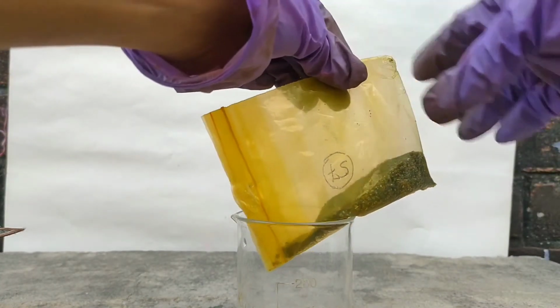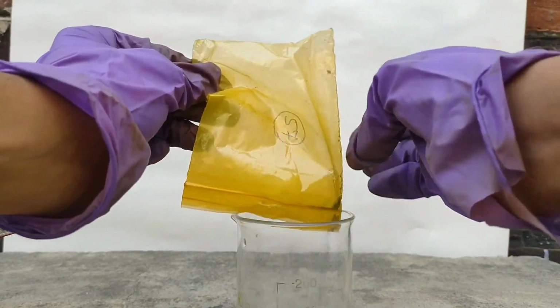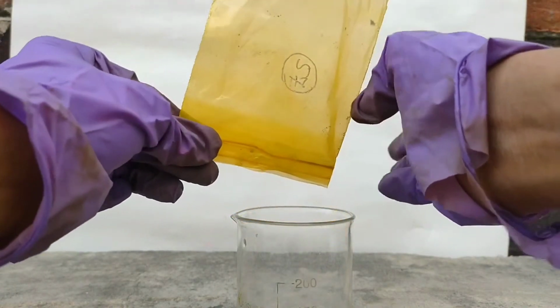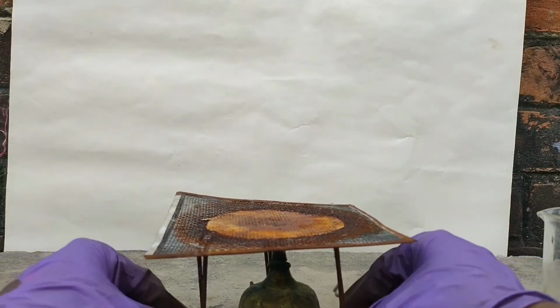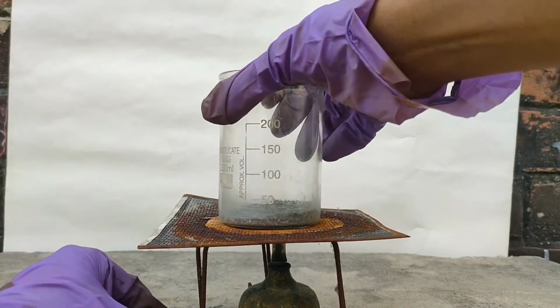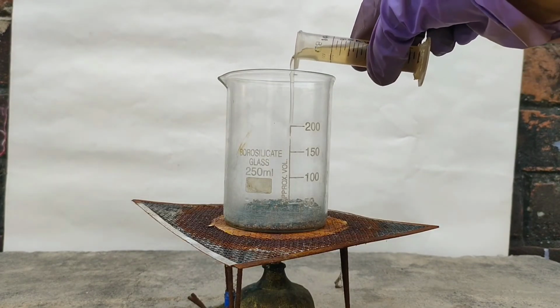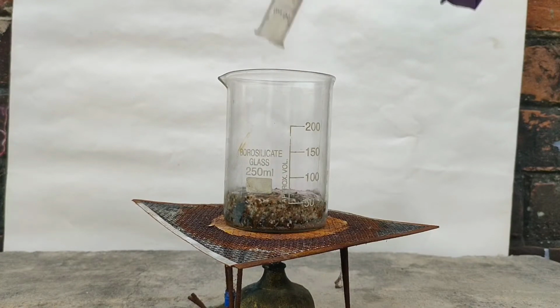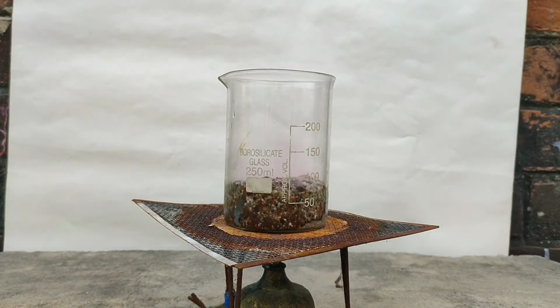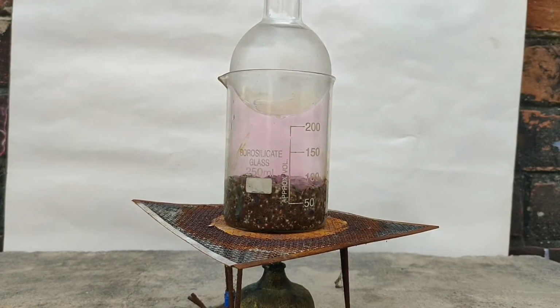Over here, I'm using a 250 ml beaker. I placed the beaker on a tripod stand. The flame was off. To this, I added 10 milliliters of concentrated sulfuric acid. As I added the sulfuric acid, you can see some violet vapors of iodine are evolved.